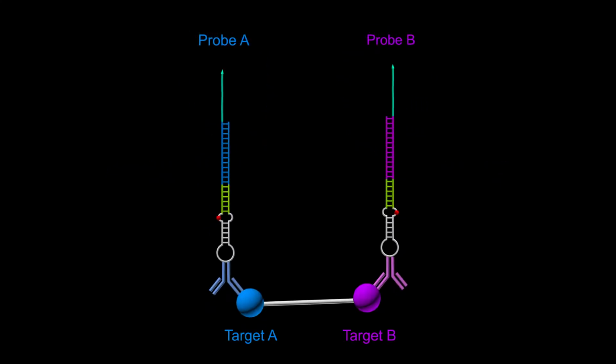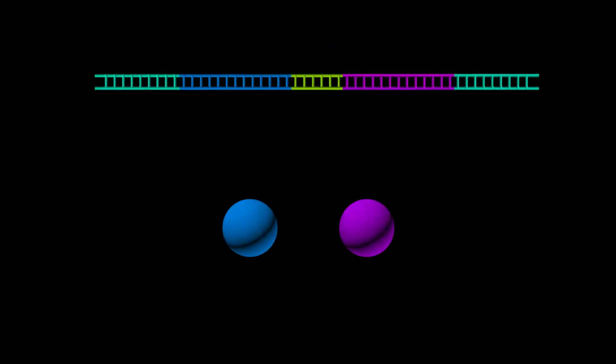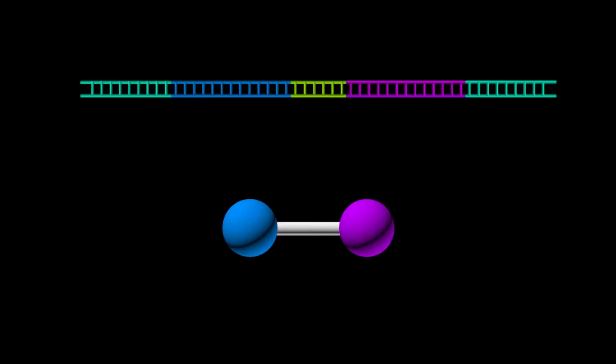After each cycle, the DNA probes are back in their initial states. They can therefore undergo repeated cycles of record generation in their pairing. Records are later analyzed for content and the pairings are reconstructed.